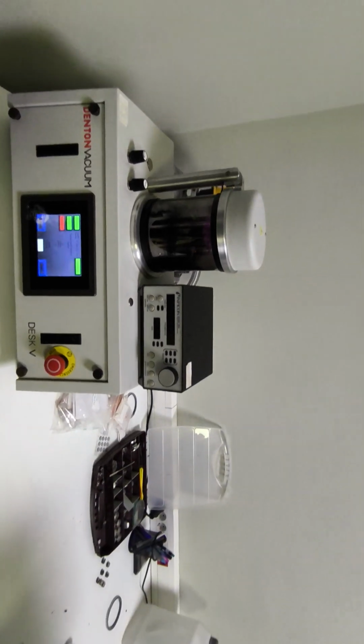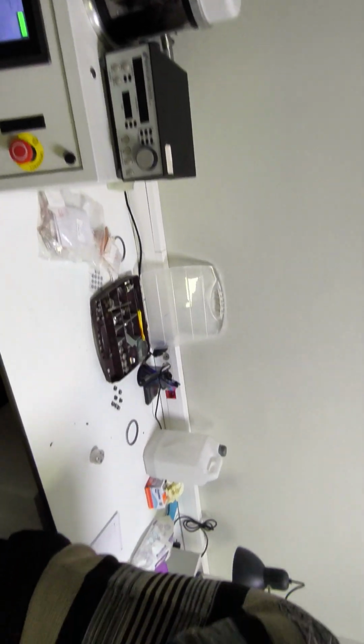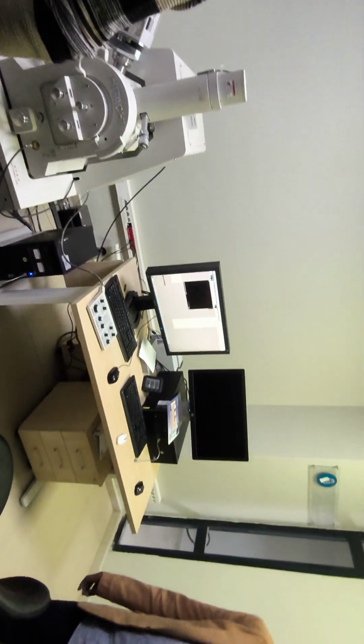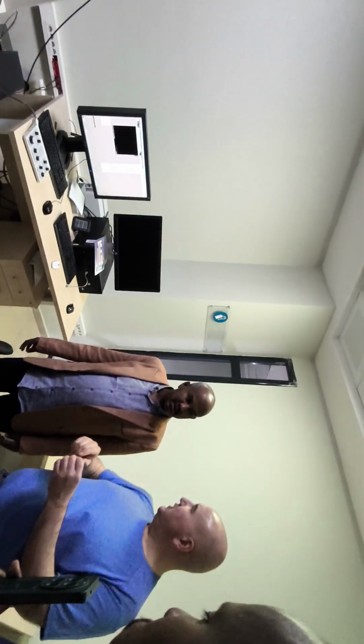If you have a sample, you can see the morphology up to 20,000 here. And we also have the mapping of elements inside the material. For example, if we are sure to have gold in a small part or a small rock, we can put the rock inside and see if the gold is outside or inside, and which kind of element it is.